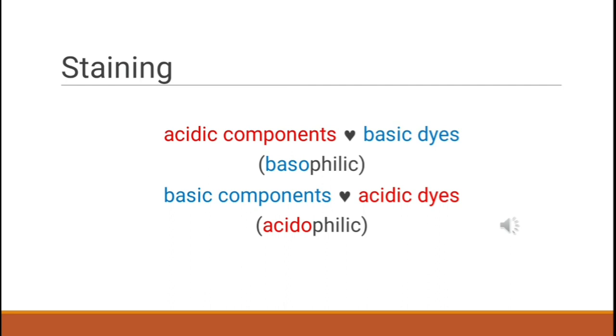Now, I want you to remember this, everyone. Acidic components have an affinity to basic dyes, thus they are termed basophilic, and basic components have an affinity to acidic dyes, and they are termed as acidophilic.